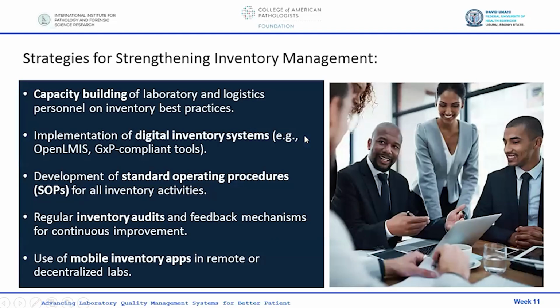Now, what are the strategies for strengthening inventory management? One of them is capacity building of labs and logistics personnel on inventory best practices. Another one is implementation of digital inventory systems, for example, the Open LMIS, and the rest of them.